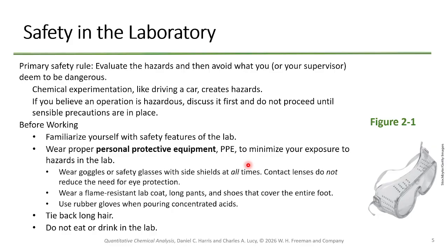Personal protective equipment, by the way, is abbreviated PPE, in case you're ever wondering. So if you ever hear PPE, that's what that means. It means things like your splash goggles. We have to wear splash goggles in this lab very specifically, because I'm using fairly caustic materials, because we have to break everything down all the time. And if anybody splashes to the side of you and gets you, they're going to hurt you.